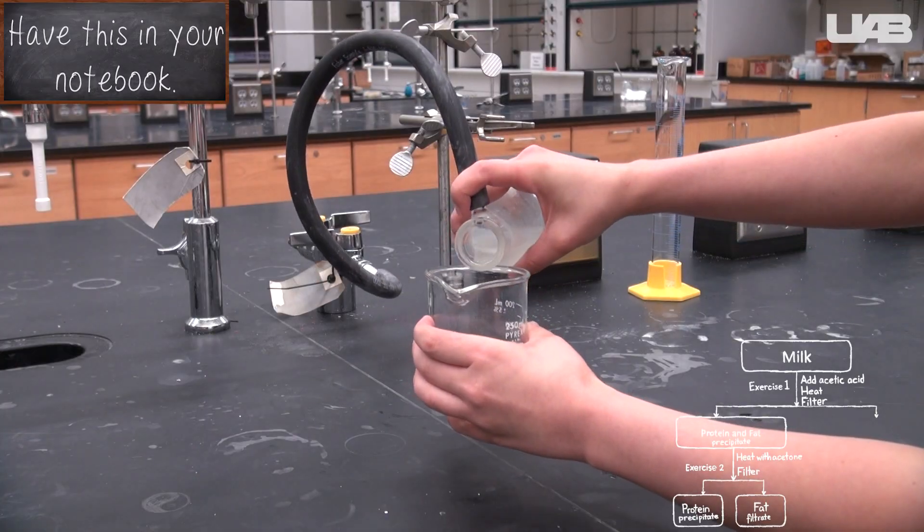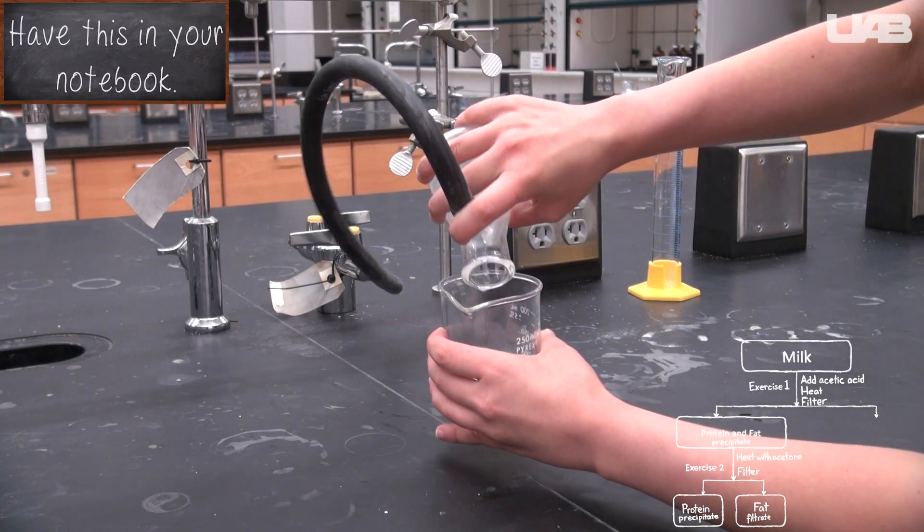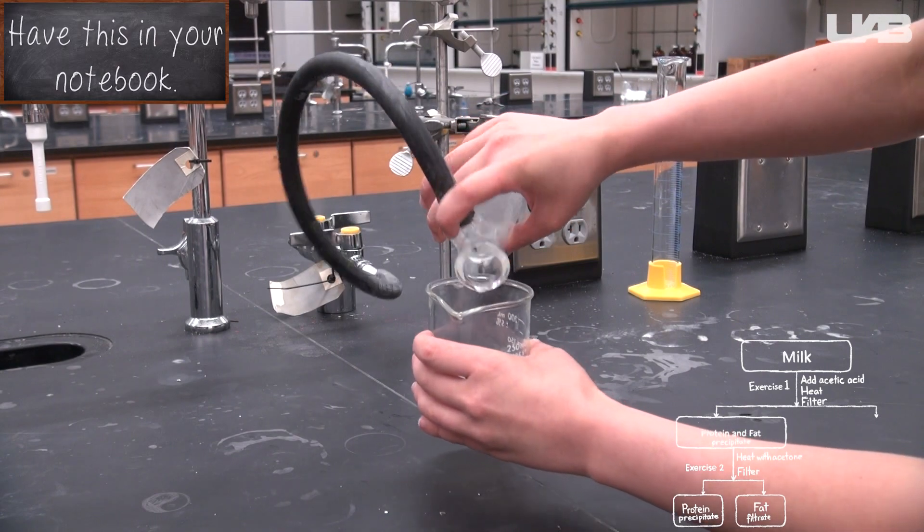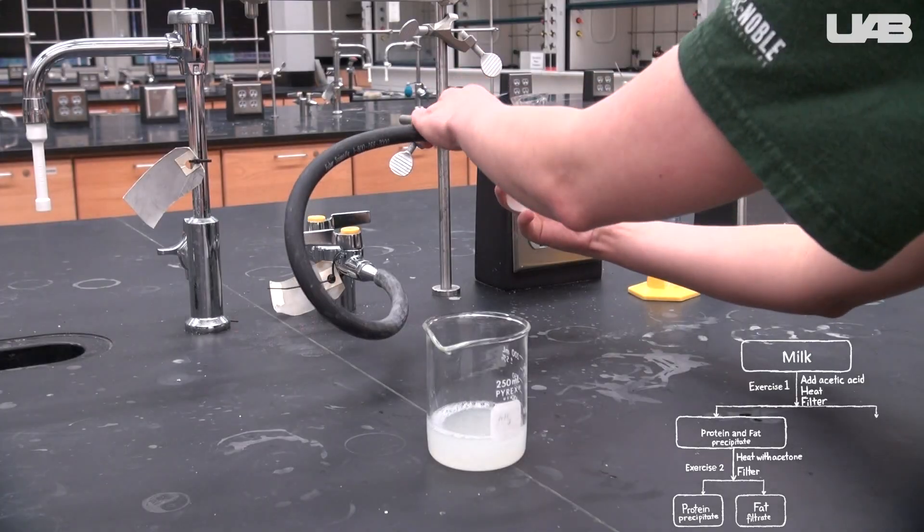When you pour the filtrate into the beaker, pour away from the side arm so that the liquid does not go into the side arm or the tubing. You want all the filtrate to end up in your beaker.